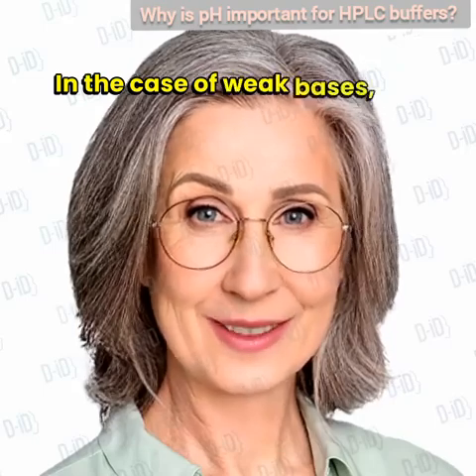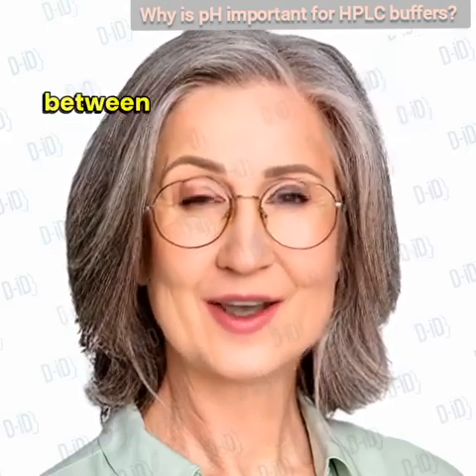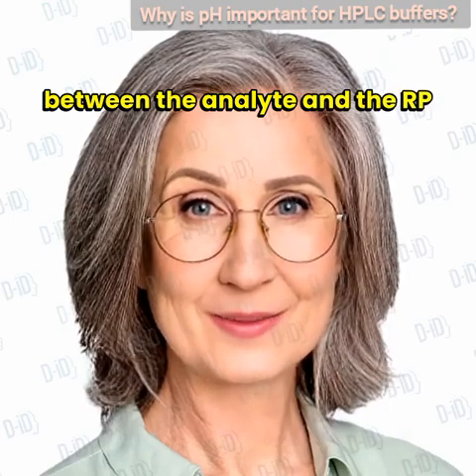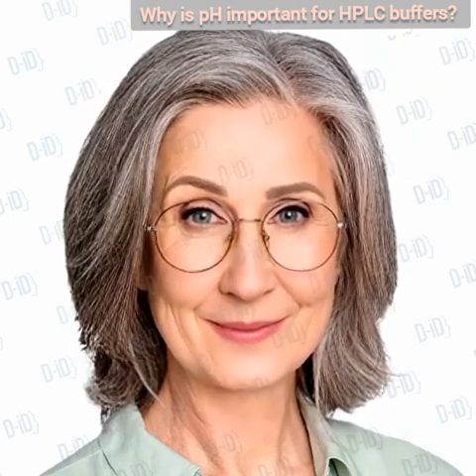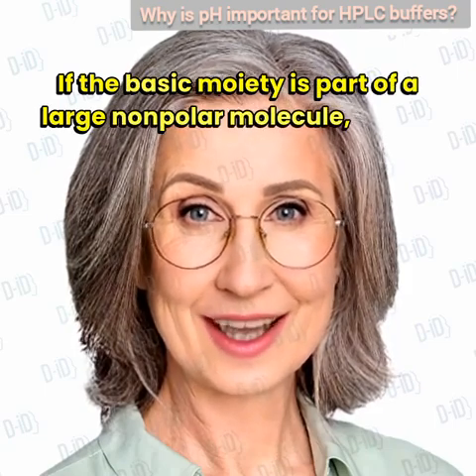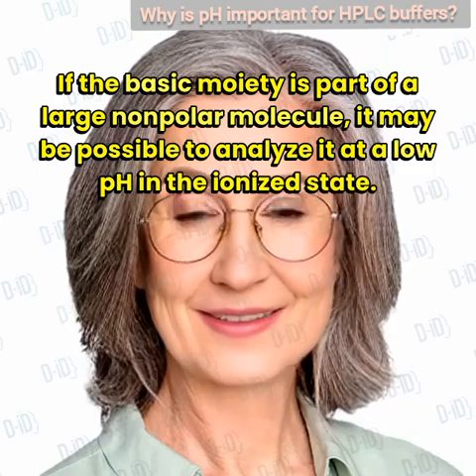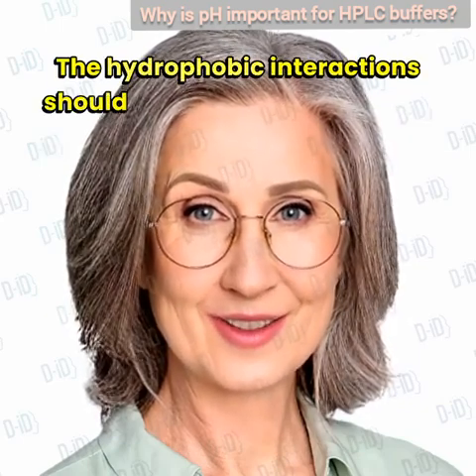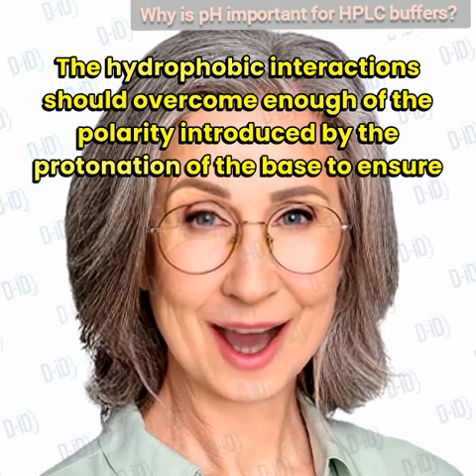In the case of weak bases, the first option relies on exploiting any additional hydrophobic interactions between the analyte and the RP stationary phase to maintain sufficient retention. If the basic moiety is part of a large nonpolar molecule, it may be possible to analyze it at a low pH, in the ionized state. The hydrophobic interactions should overcome enough of the polarity introduced by the protonation of the base to ensure adequate retention.